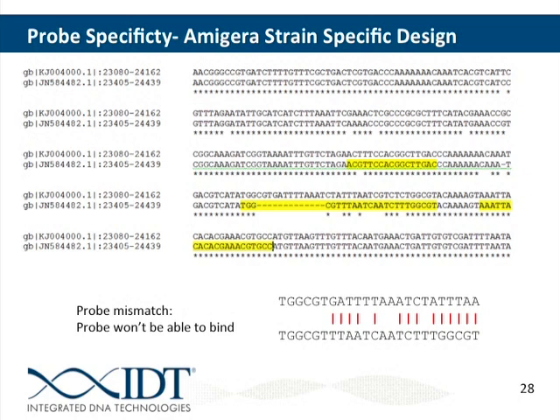So even if we would get amplification, because these primers could potentially amplify, we're not going to get any probe signal. Alternatively, if you feel more comfortable, you can try to design your forward primer or reverse primer in this region too. You can force PrimerQuest to do that and avoid amplification.